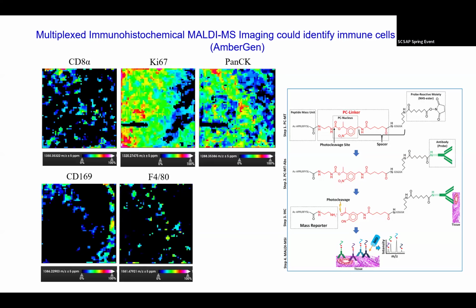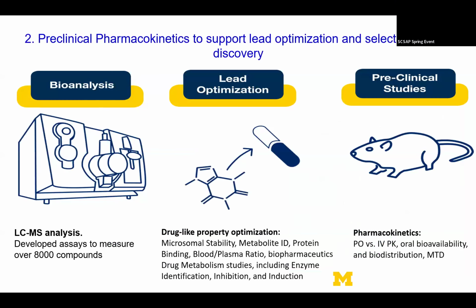For small molecule imaging, you have much more resolution, but for antibody, the resolution is not as good as fluorescence. The advantage is you can really multiplex, small molecule versus larger molecule, because most of the time for small molecules we don't have an antibody for the immunostaining. So that's for imaging, which I emphasized a little more since this is very imaging oriented.